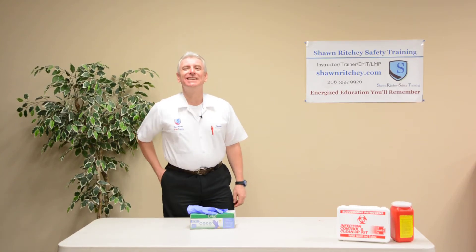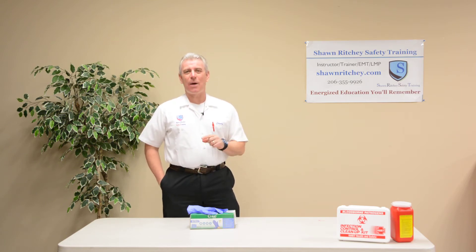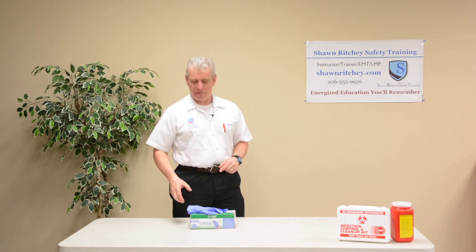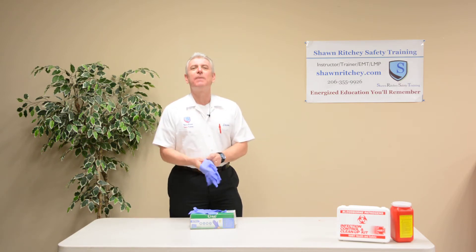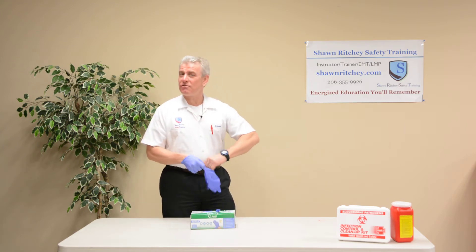Hi, I'm Shawn Ritchey and I have a passion to provide energized education you'll remember and safety training you won't forget. Today I want to talk briefly about blood-borne pathogens and the safe removal of gloves. We call this body substance isolation.